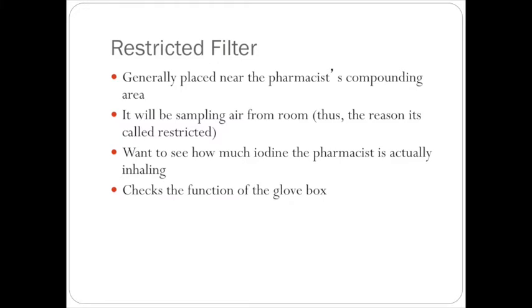And what we'll do is when we start the test, we'll put that in place, and then we will actually pull air across that filter at the same rate that we use to run the pump of the entire system. And then basically over some period of time, usually a week, we will just collect as much iodine as is present in that area. And then basically at the end of about a week, we'll go through and we'll try to determine how many microcuries of iodine are on that filter.